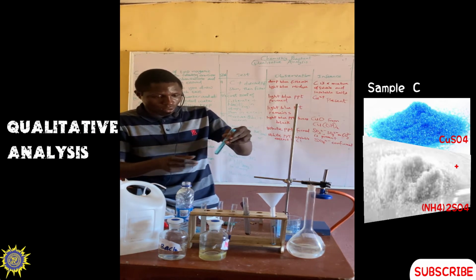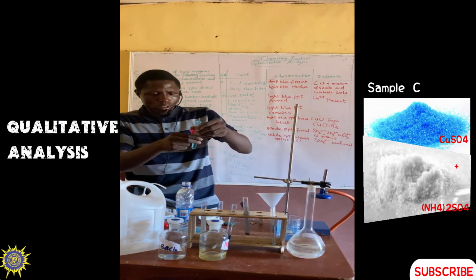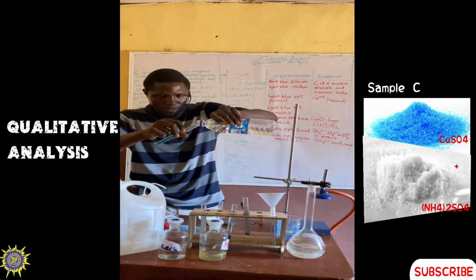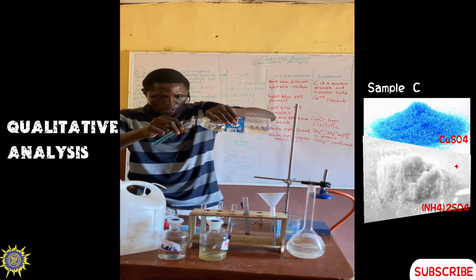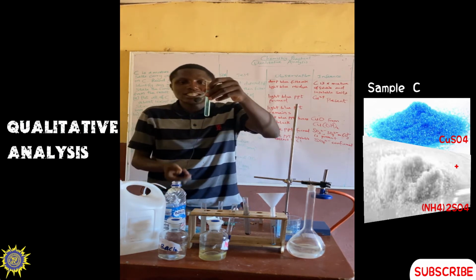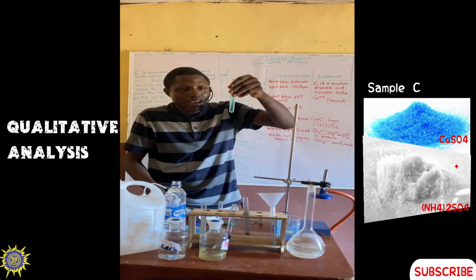You can use a glass rod to clean the side so that you don't have any residue there. So now let me try and rinse the side. So you can see effervescence has taken place. Now you can see the gas coming out. So there's an evolution of gas.